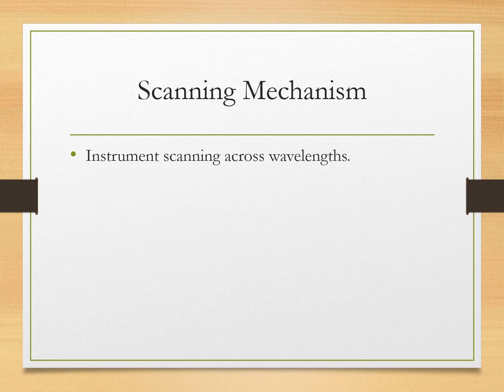During scanning, the grating rotates automatically and records absorbance at each wavelength. This results in a complete absorption spectrum.